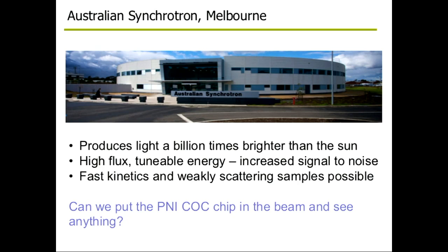So I think it might have been Tim was the first person I had this crazy discussion with about, do you reckon we can use the nanoassembler to start looking at some of these processes by putting the nanoassembler in the beam at the synchrotron?